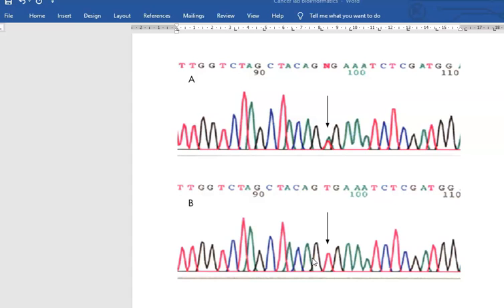Okay, so that's all from me. So you've now seen SNP analysis in the lab, and you've seen how we could amplify that same bit of DNA by standard PCR, and that PCR product would then be perfectly suited for direct DNA sequencing. Both methods are perfectly good for detecting point mutations.